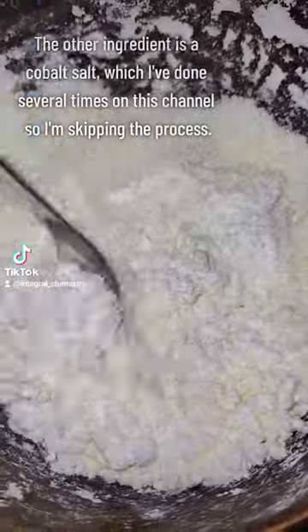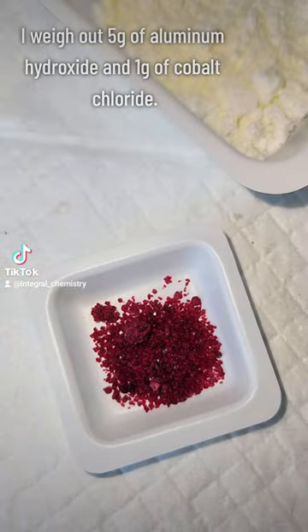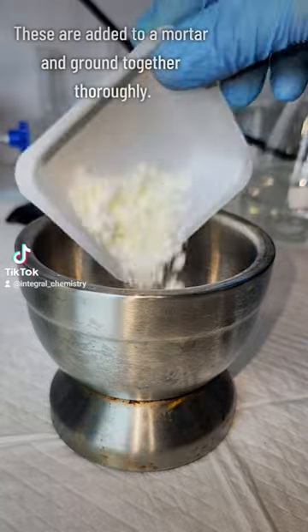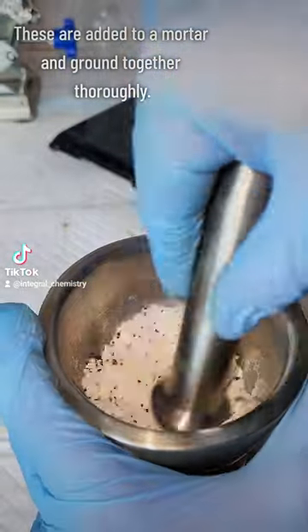The other reagent is a cobalt salt such as cobalt chloride or cobalt nitrate, and since I've made that several times on this channel already, I'm not going to do it again. I weigh out 5 grams of my aluminum hydroxide and 1 gram of my cobalt chloride, and these are added to a mortar and ground together extremely thoroughly.